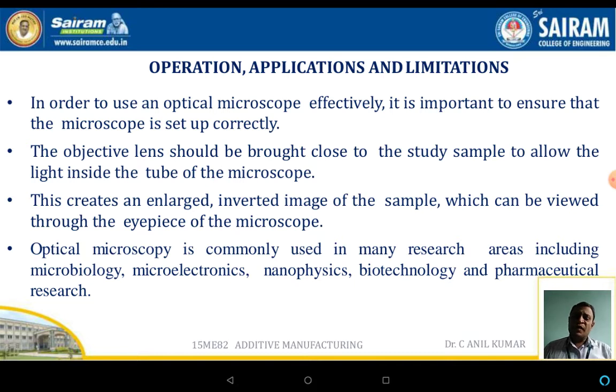Optical microscope is commonly used in many research areas, including biology, electronics, physics, biotechnology and pharmaceutical research.